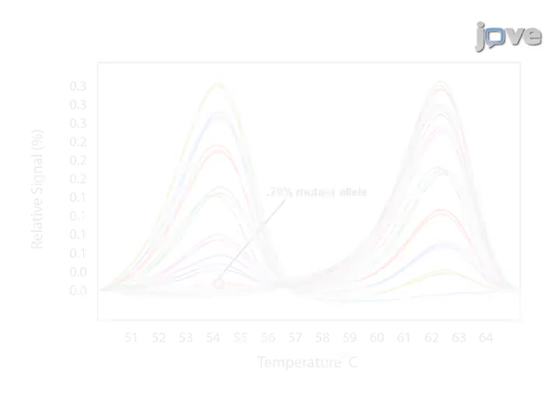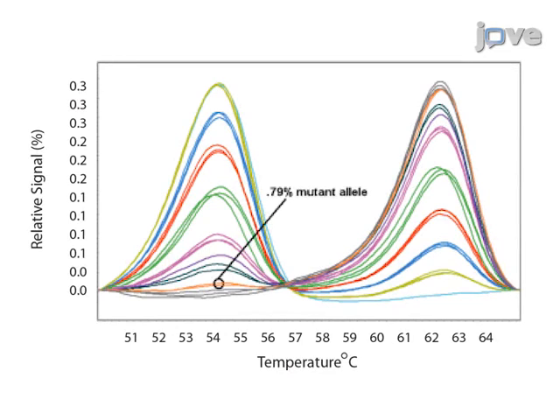Ultimately, mutant allele amplification bias and probe-based asymmetric PCR allow more sensitive detection of challenging SNP mutations at low concentrations present in samples. This increased sensitivity is useful for mutation surveillance in populations.